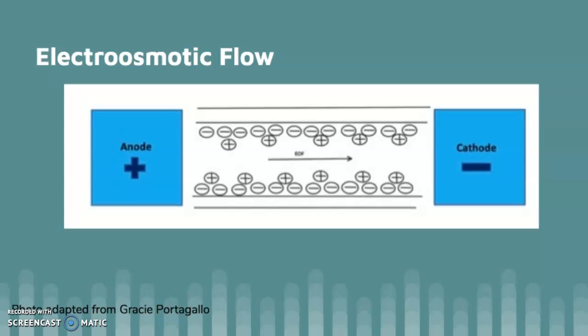This image here shows the capillary used to carry out the enzyme assays. In order to use the capillary, there's 2 steps that you need to do in order to prepare it. The first step is washing the capillary with sodium hydroxide to deprotonate where the electroosmotic flow is going to occur. Next, you want to wash the capillary with a buffer. The higher the pH, the stronger the charged double layer is, which would mean the higher the osmotic flow. So using a buffer with a high pH ensures that you have a strong double layer.